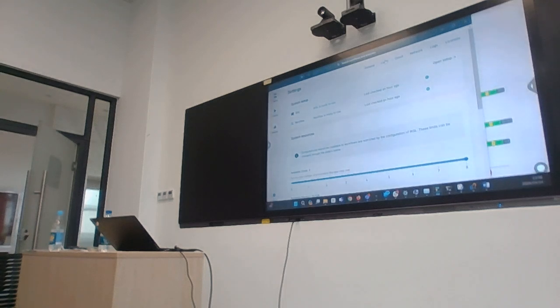No, this needs Windows update as well. We have to update Windows. We have to go to Windows update. Do you have admin rights? I hope so. We have to. Yeah.